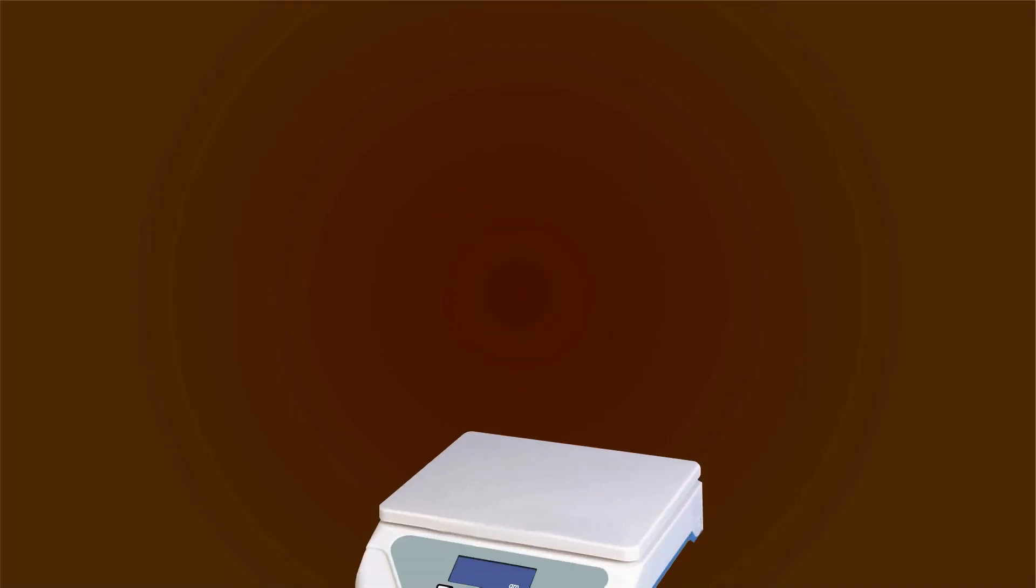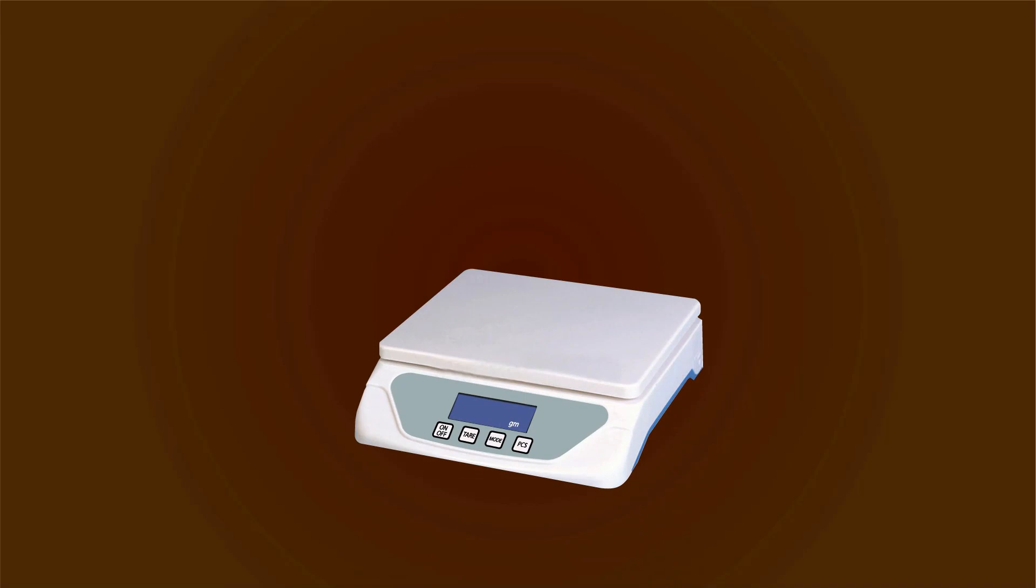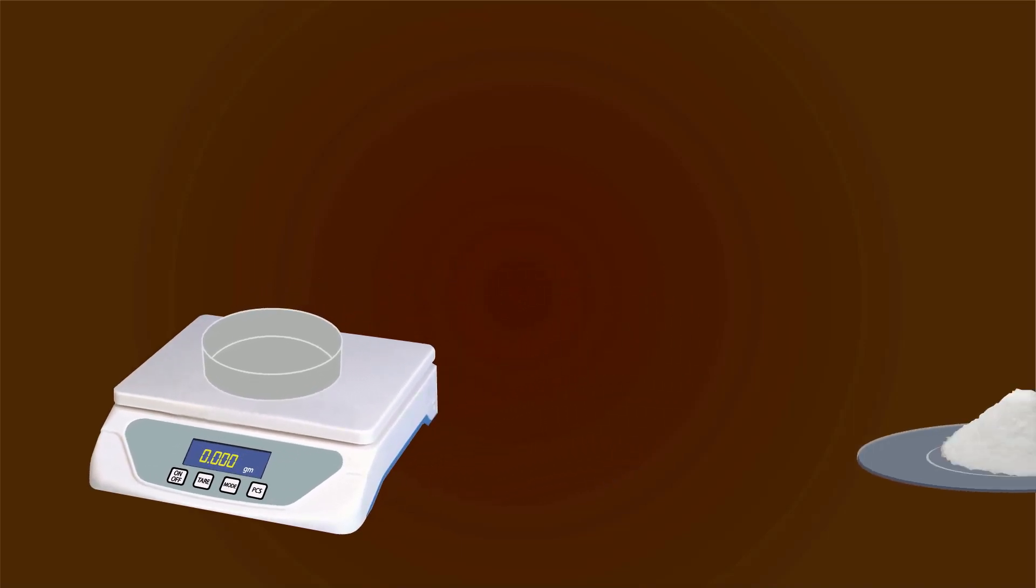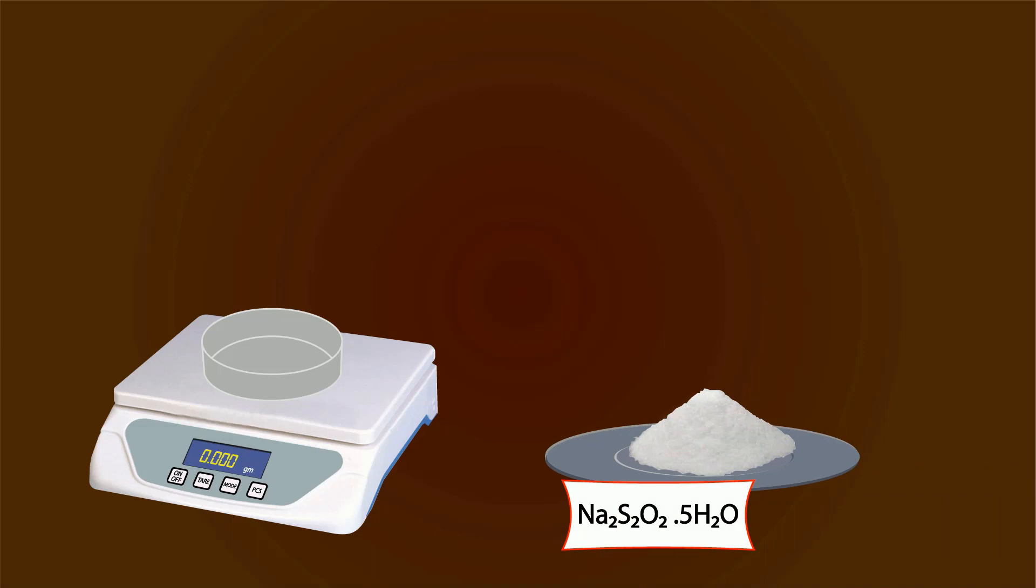Let's start preparation. First of all, take a weight balance and power it on. Now put a petri dish on it and tare it down. You can add sodium thiosulfate into the petri dish with the help of a spatula. Start adding and measure precisely as 4.964 grams.